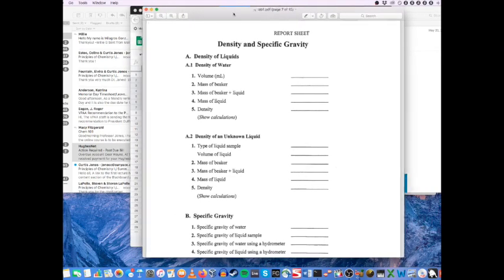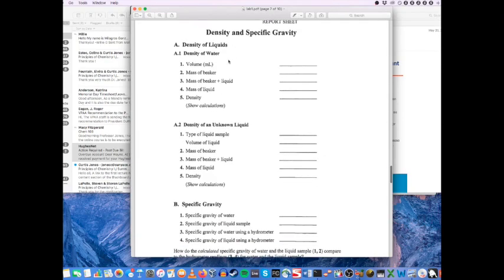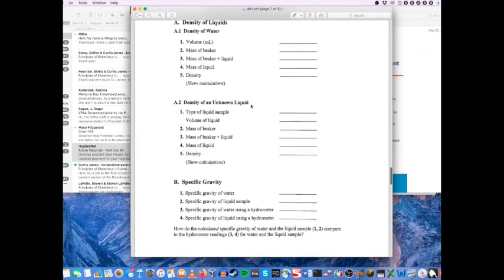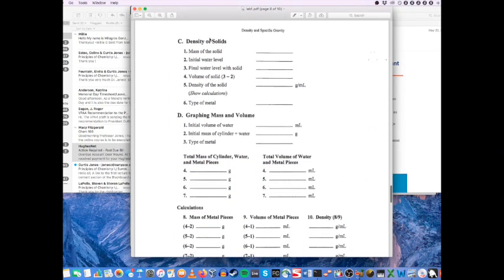So what I will do first is talk about the lab report that I've generated for you in this video, and then I will post a separate video explaining the whole process of logging into Google Classroom for this course for the first time. I have posted a link to that as well on the Blackboard page. Here is all the data that we have collected for this experiment, and for part D, I have provided data for you. So we'll take a look at what that means.